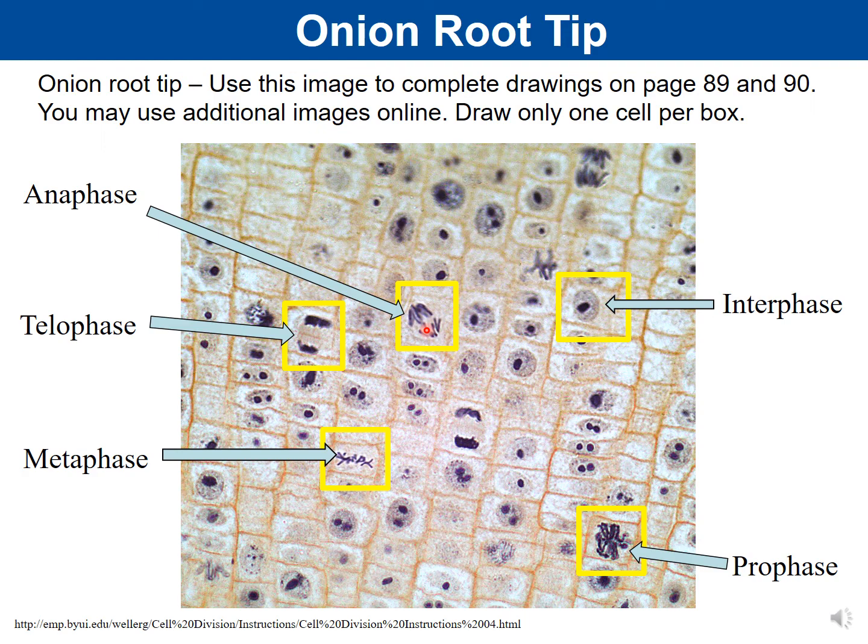And so that's just to get you to think along these lines of practical applications of this, is that when you're talking about cancer therapies, right, you're talking about inhibiting cell division. And so one way that we can do that is by targeting microtubules, because microtubules play a role in the spindle, which is going to play a role in cell division. So that's anaphase. Here's another example of anaphase up here. So there's another example of anaphase.